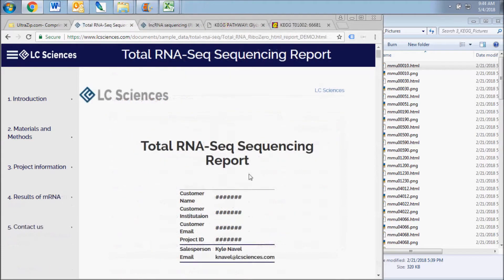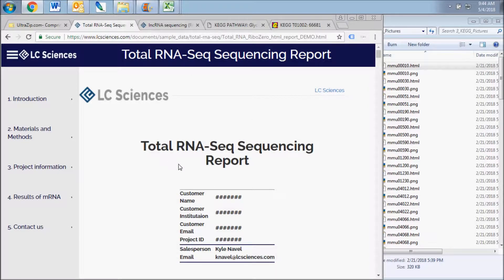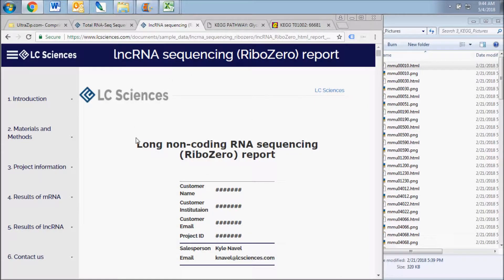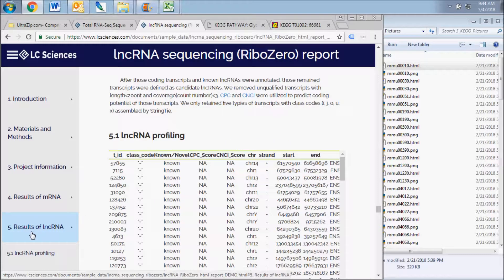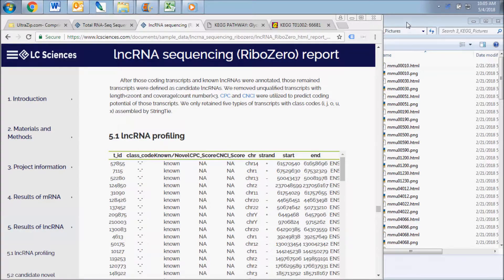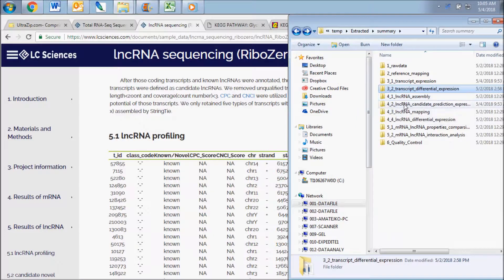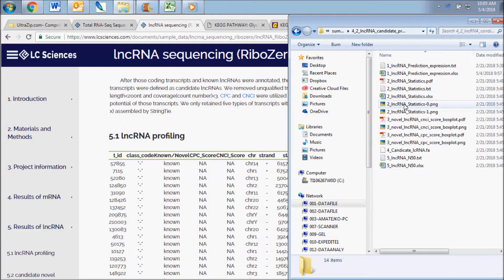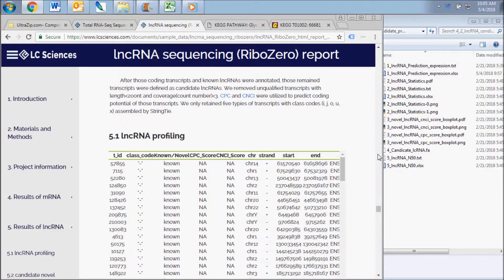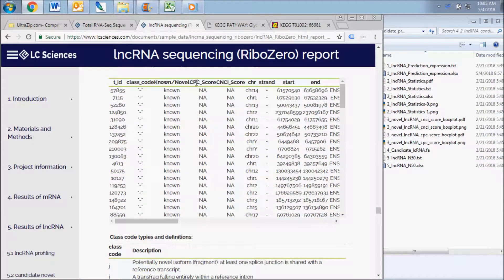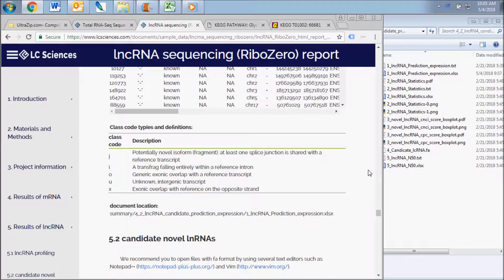If your sequencing library was produced using a ribosomal RNA depletion method, as in the case of total RNA sequencing or long non-coding sequencing, the report will contain a section of long non-coding RNA results. The first long non-coding RNA results subsection displays the data contained in the non-coding RNA candidate prediction expression folder. This data is similar to what was reported above for the mRNA transcript expression. Look below the long non-coding RNA chart for class codes and definitions of the different types of transcripts sequenced.